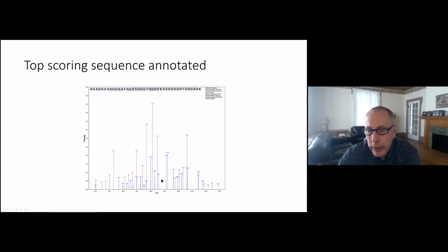But anyway, you can see that there's a few little gray peaks. I don't know how well it's showing up on your monitor. But most of the big peaks in this spectrum are covered. And if you look at the score here, which is probably hard to see, it's 42.429. What that score means in MetaMorpheus world is that there's 42 matching fragment ions, and 42.9% of all the intensity in the spectrum is accounted for by matches to these ions.